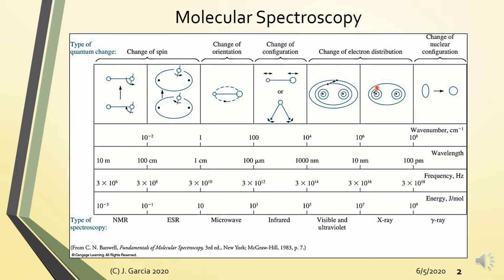So nandoon siya. Ano may inner core shell? Ito yung shells or orbitals na malapit sa nucleus. And for you to penetrate that deep for a given analyte or compound, kailangan mo na mas mataas na energy level.